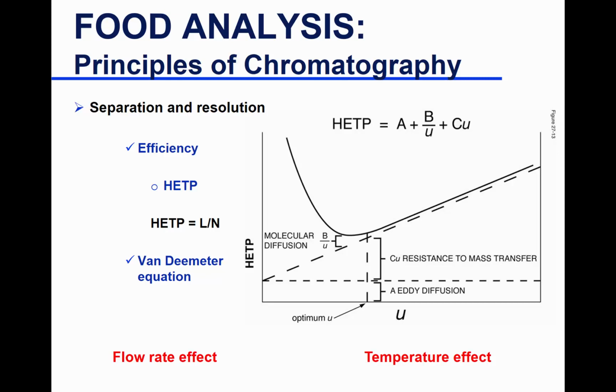Yes? So you said the quicker it reaches equilibrium, what happens to the plate height? It's smaller, yeah. Because all of these are segments of equilibration. The N, the height equivalent theoretical plate, is an equivalence of reaching equilibrium between the stationary phase and the mobile phase.